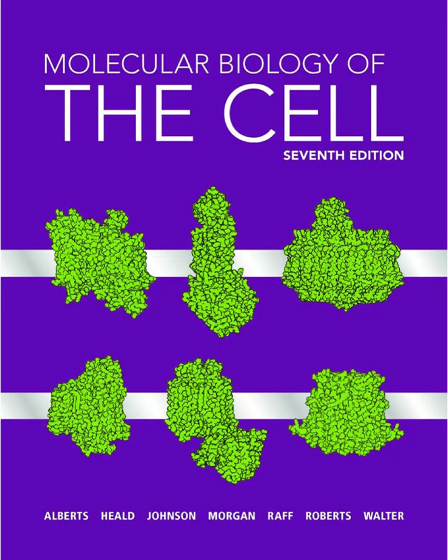So light from above or below the focal spot, the out-of-focus light, hits the edges of the pinhole and gets blocked. Precisely. It physically rejects most of the out-of-focus blur. Then the laser spot is scanned across the specimen, point by point, line by line, to build up a complete sharp optical section.